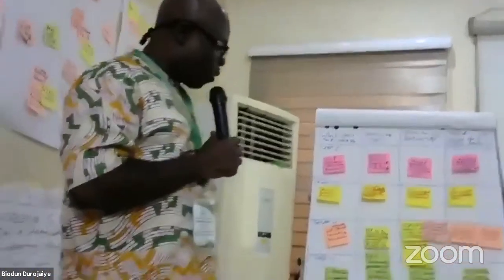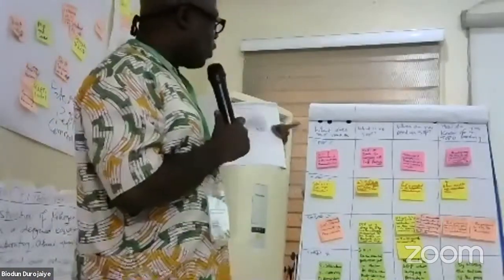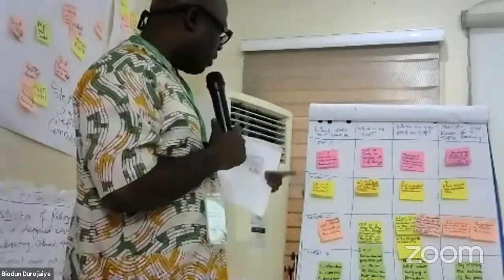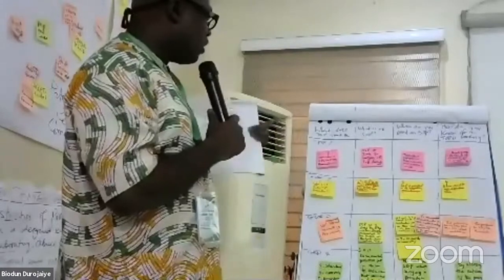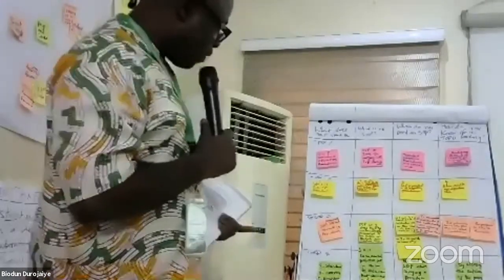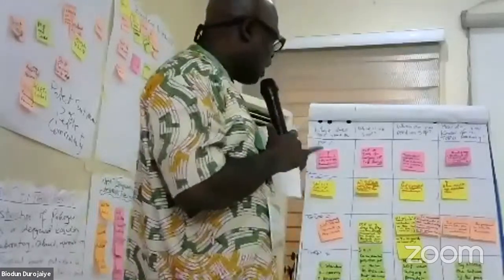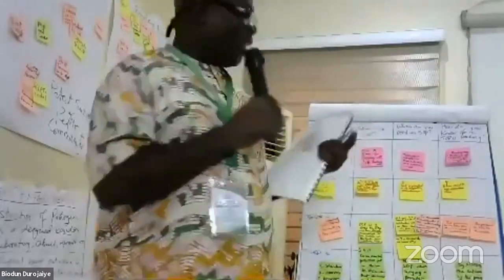We're now looking at some differences. The first one is, what does SOP stand for? I think all the groups have said something that appears to be similar. So we have SOP is standard operating procedure. All five groups have a similar answer to that. Then, what is an SOP? It's a guide to carrying out lab procedures. Not only lab.